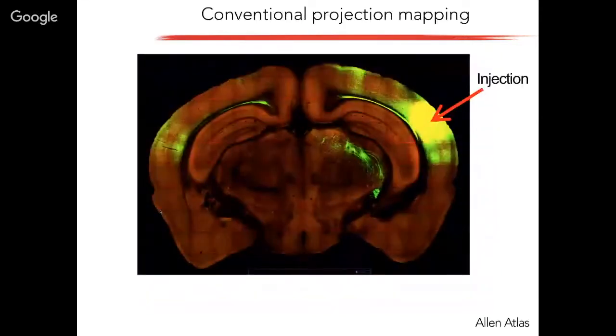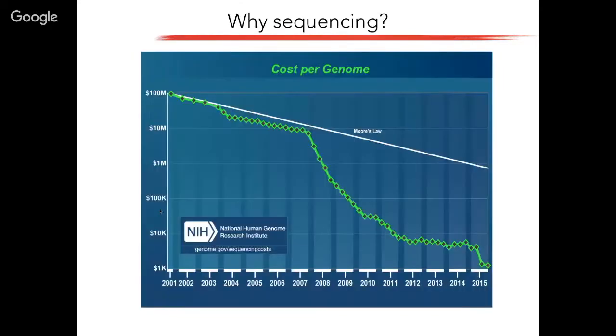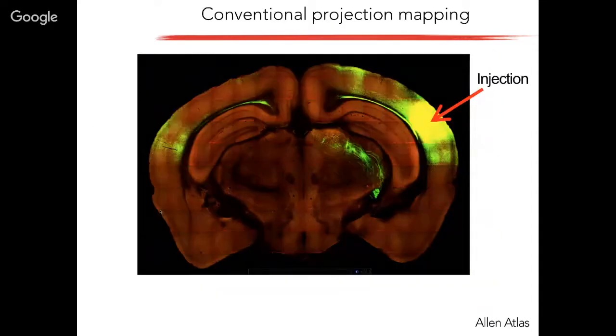All right, so right now what I'm going to focus on is the form of this technology that actually works really well in my lab today. We've set up a core facility. We offer this as a service now to collaborators, and that's projectome mapping. That's the mapping of long-range projections at high throughput at single neuron resolution.